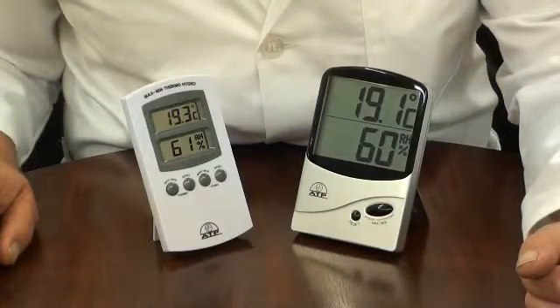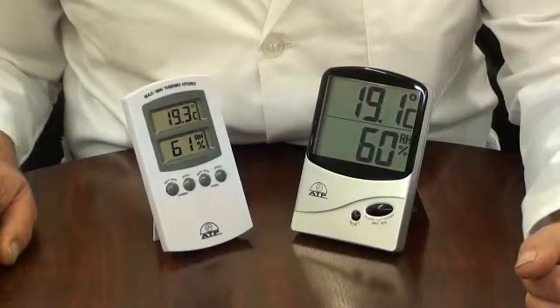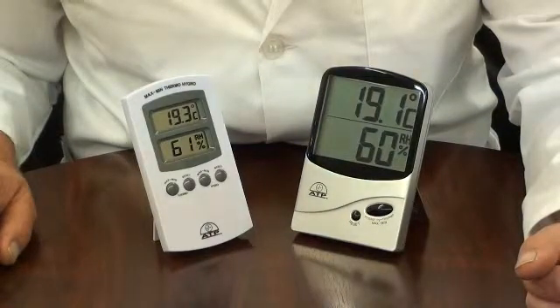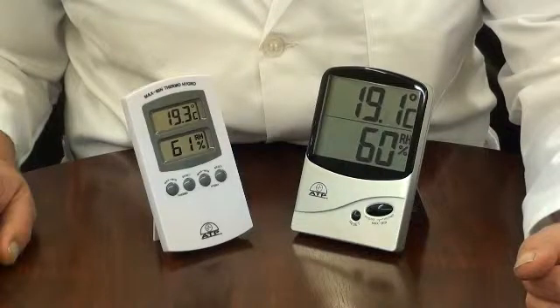Both units have sensors internal to the main unit, making these ideal for monitoring many applications in industry, laboratories, and education where temperature and humidity measurements need to be monitored. The temperature range is minus 10 to 50 degrees C and the humidity range is 25 to 98% RH.